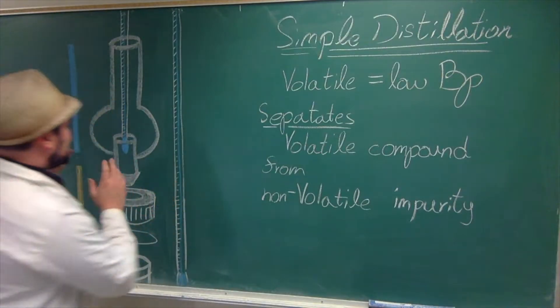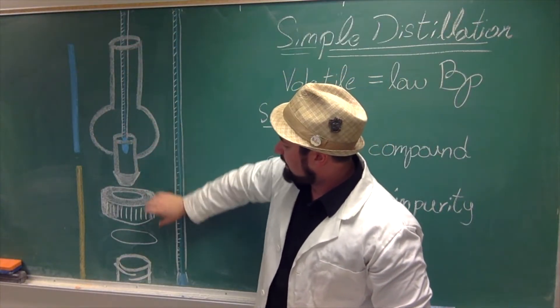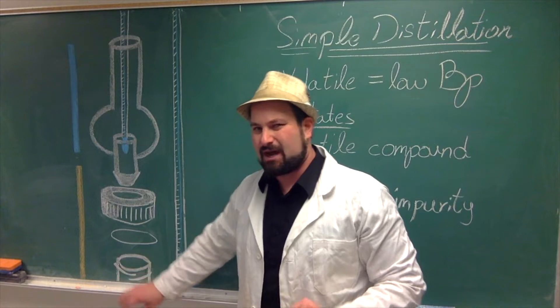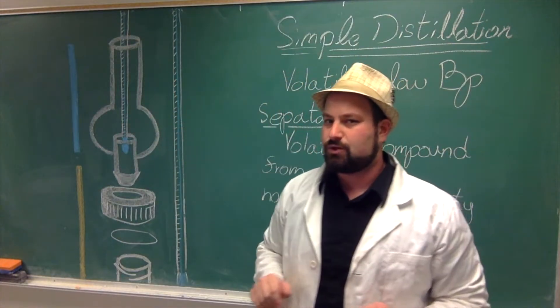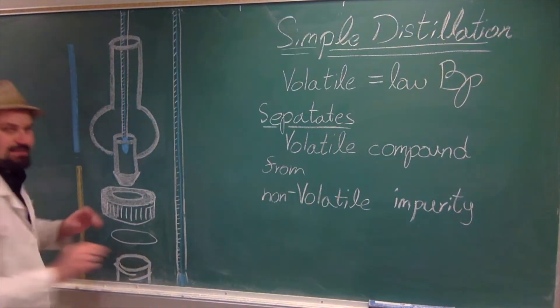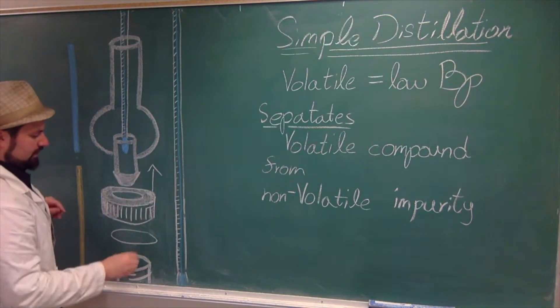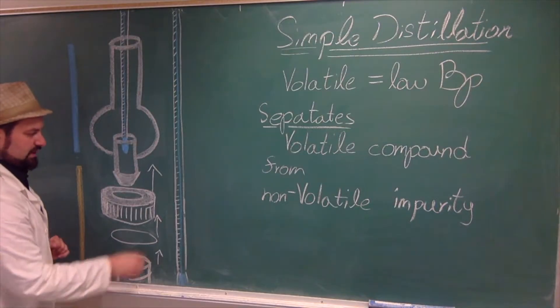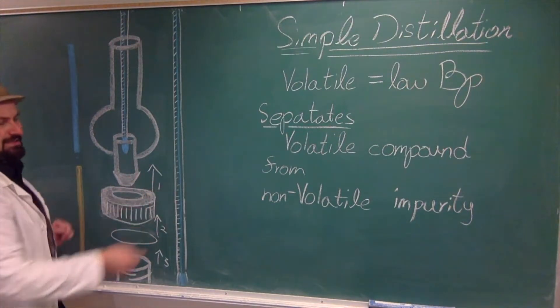Here is our setup. We have our Hickman distilling head, a cap with a hole, an O-ring, and a conical vial. When assembling it, it is immensely important that you take the Hickman first, then put the cap with the hole on, then the O-ring, and then the conical vial, which has a screw cap. That's one, two, three. If you do it out of order, you're not going to get a good seal and things will just escape from the sides.